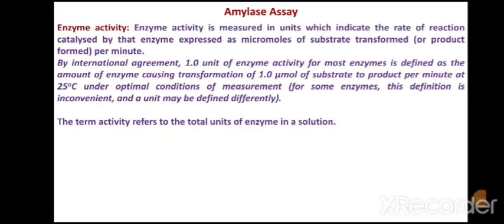Now, let us see how exactly the amylase assay is performed. This is just an example. In order to understand the methodology of measuring the enzyme activity, in this case the amylase activity, we need to understand a few definitions that you might have learned during your theory. So let us repeat that. Let us see first what is the definition of enzyme activity.